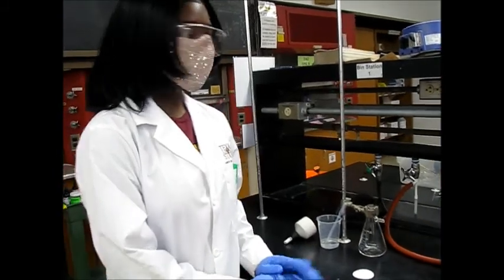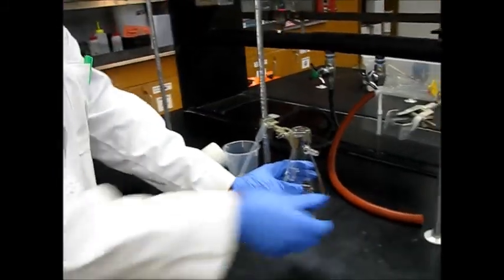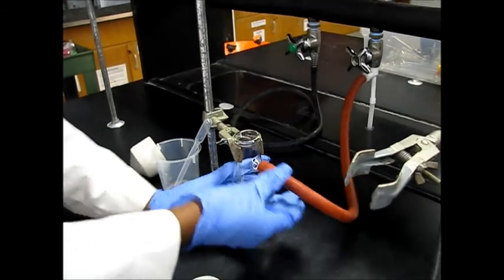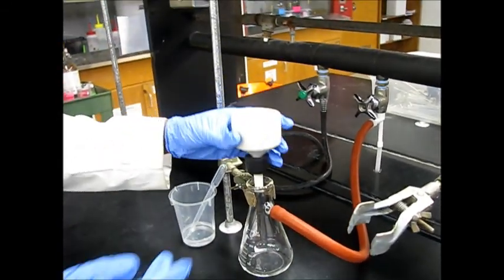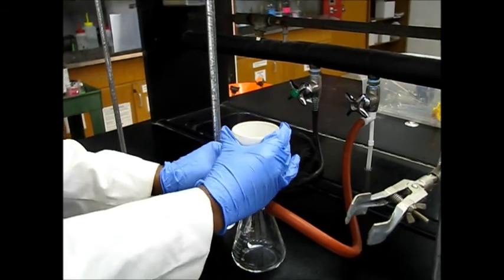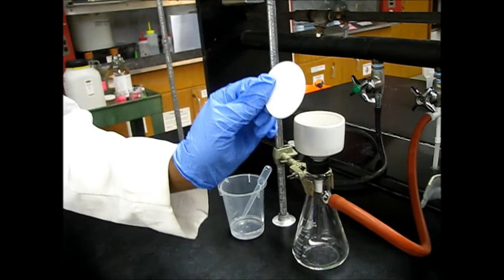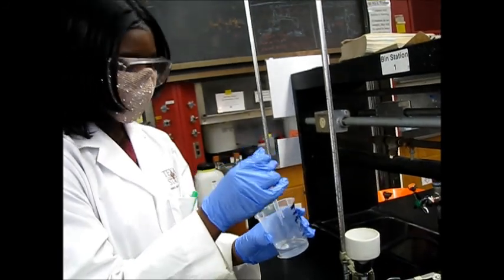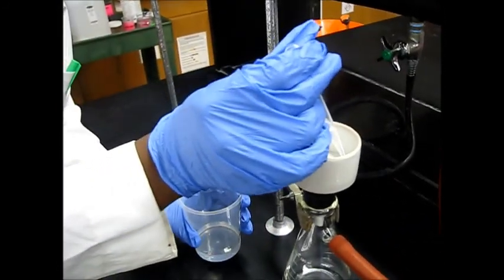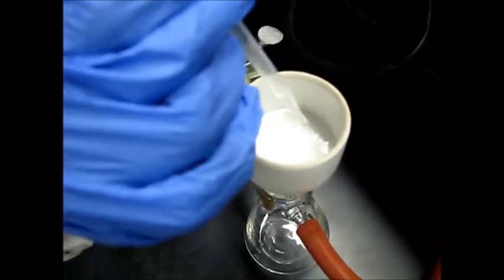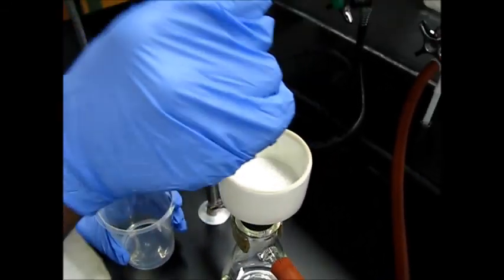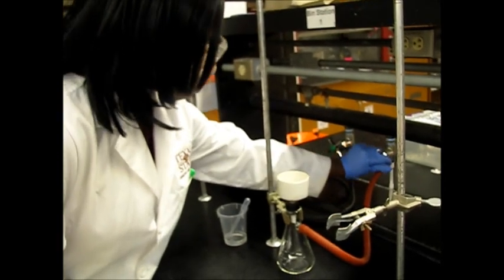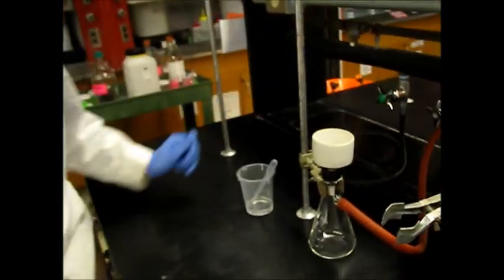Now we are about to set up our vacuum filtration. So we have our vacuum flask here. We are going to attach the hose securely. We have our Buchner funnel. We are going to add that. We are going to get our filter paper. We are going to place that inside. And next we are going to add some water to fully cover the bottom. Now we are going to turn it on. Now it is ready for filtration.